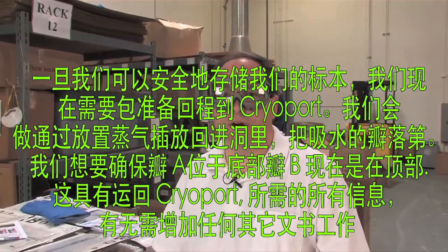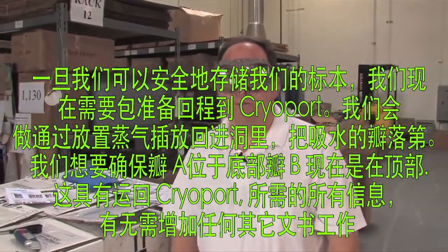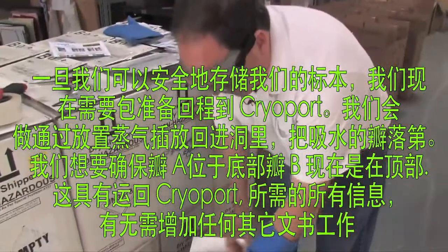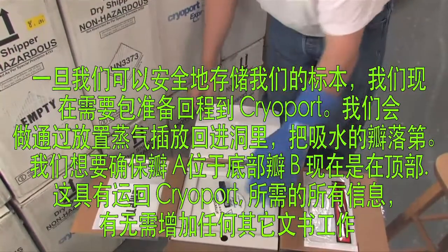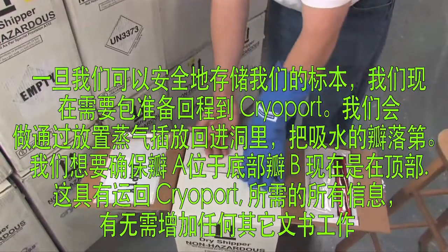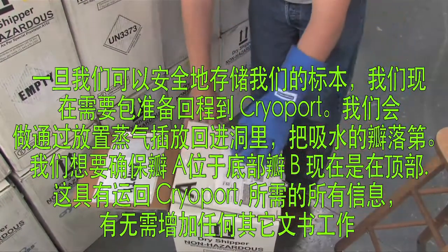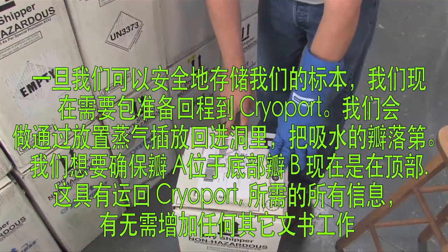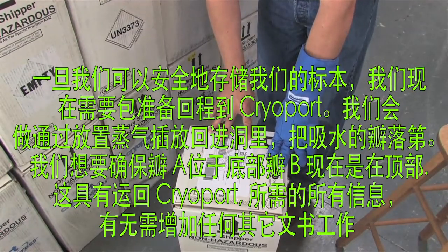Once we've safely stored our specimens, we now need to prepare the package for its return trip back to Cryoport. We'll do that by taking the vapor plug, placing it back in its hole, and putting the absorbent pad flaps down first. We'll want to make sure that flap A is at the bottom and flap B is now on top. This has all of the information required to ship back to Cryoport.